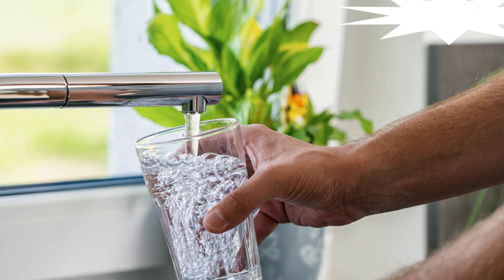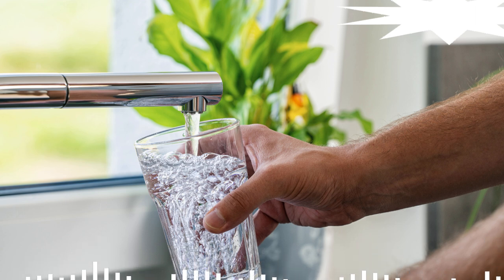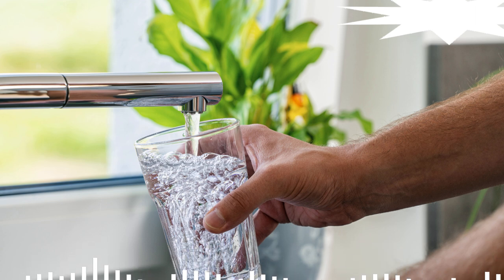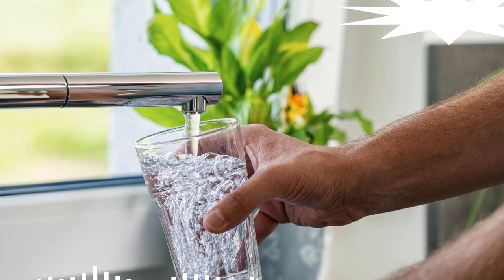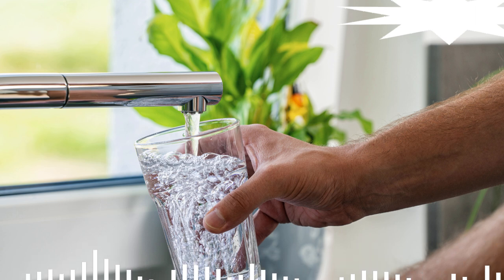Instructions. Step 1. There are two types of water hardness: carbonate, temporary, and non-carbonate, permanent. The first is removed by boiling, about an hour. After that, a white precipitate, calcium carbonate, and carbon dioxide are formed. The second is more difficult to eliminate, either chemically or by distillation. The total water hardness is determined by the sum of the permanent and temporary hardness.